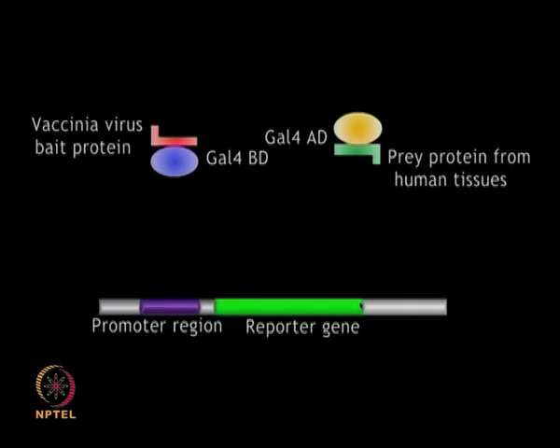So, let me show you by this interaction how this yeast two-hybrid screening can be used. Let us drag and drop the components so that the transcription will be carried out.